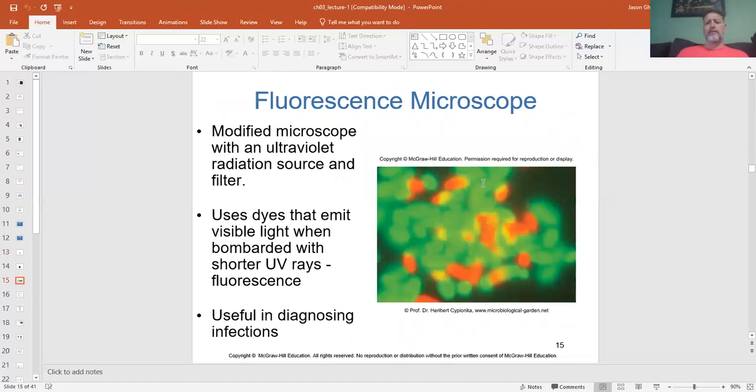There's a fluorescent microscope. This type of microscope uses ultraviolet radiation. You coat the specimens and they fluoresce based on the types of dyes and types of species they are. But you cannot look at these with the naked eye because the ultraviolet radiation is damaging to the eye. But you can distinguish between different species using this one just because they fluoresce in different colors.